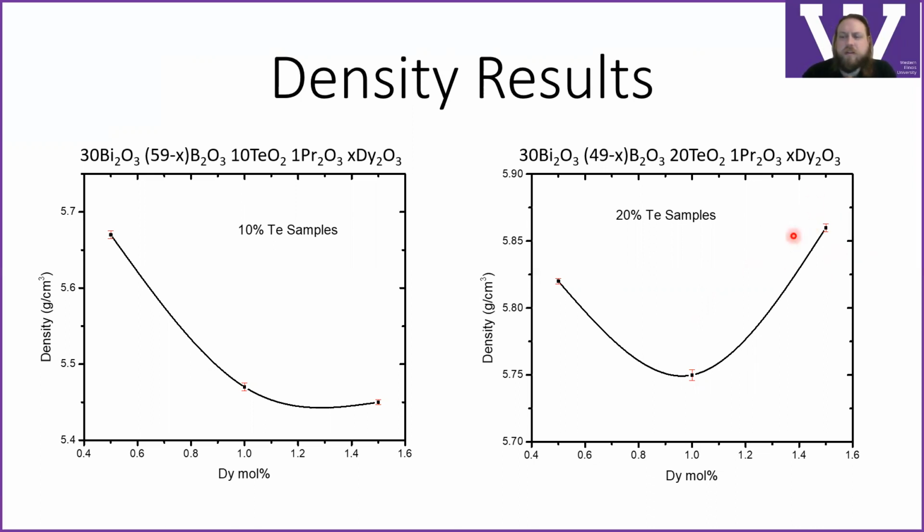So this point here is saying that maybe the structures are fitting together a little bit better, but also if we look at this as a whole, the density isn't changing very much. We have about somewhere between 5.80 and 5.85 here, 5.75 here, and then 5.85 here. So this isn't changing all that much. So it could not be super significant yet. We'll have to look into that a little bit more, but right now you see a kind of interesting increase.